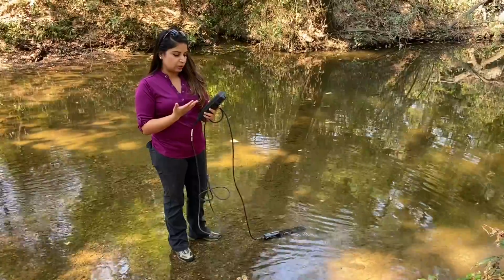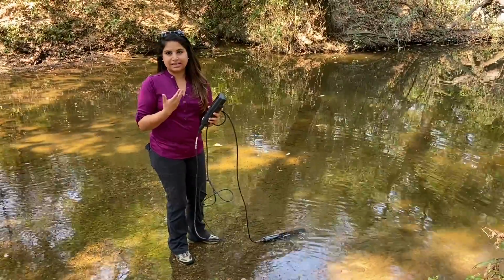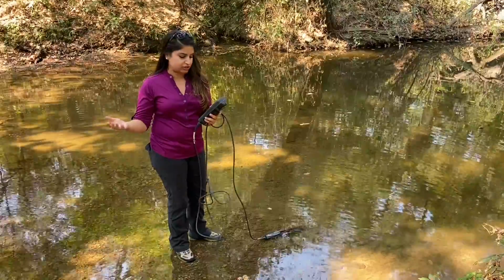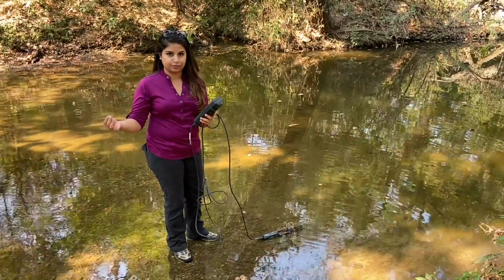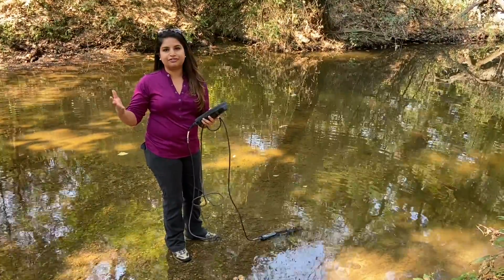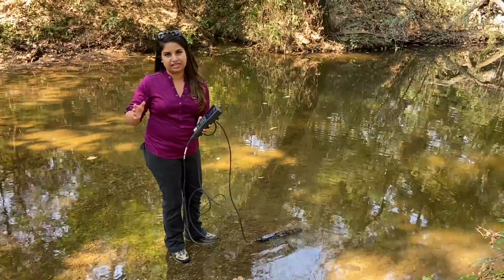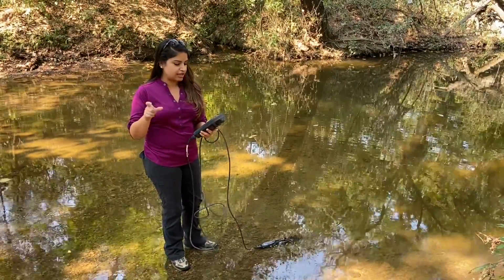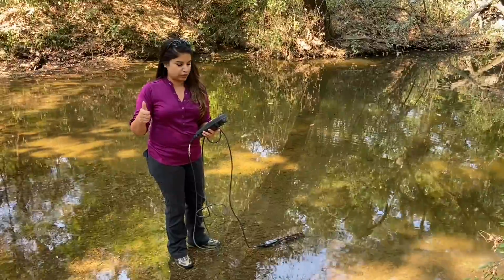So right now, looking at the readings, I can tell that this is a pretty healthy water. The pH is within range. There's a very low amount of turbidity in the water. The dissolved oxygen can vary within a range because this is flowing water. We won't get a fixed number. So as long as it's stable within a range, we're good.